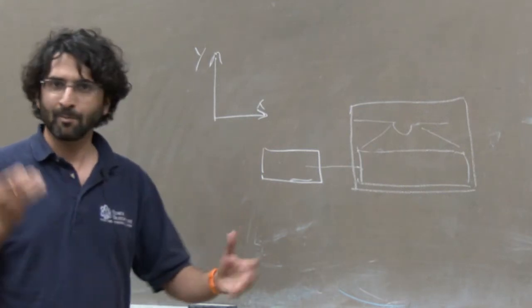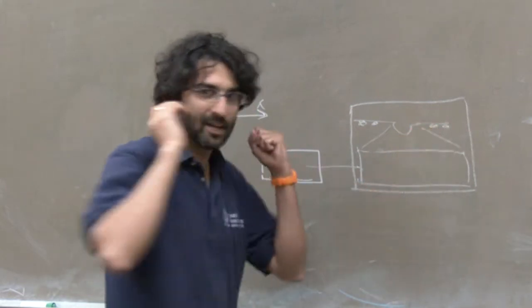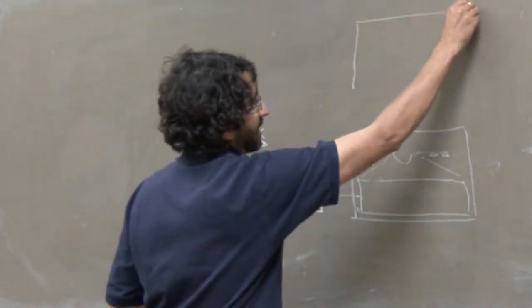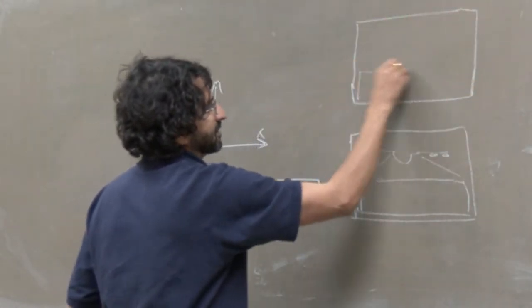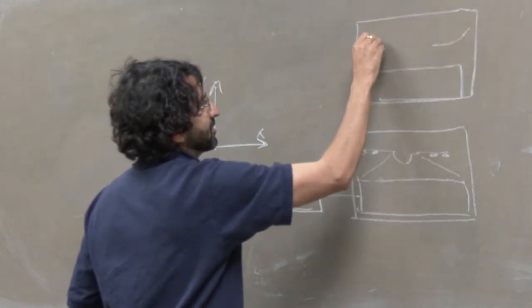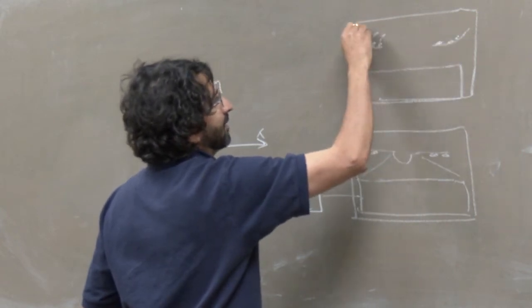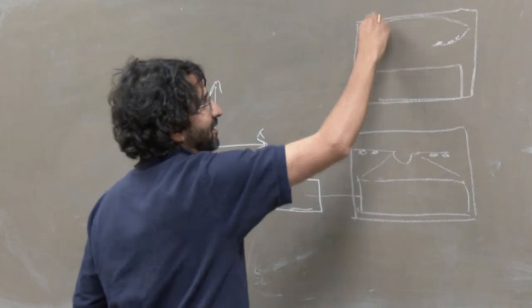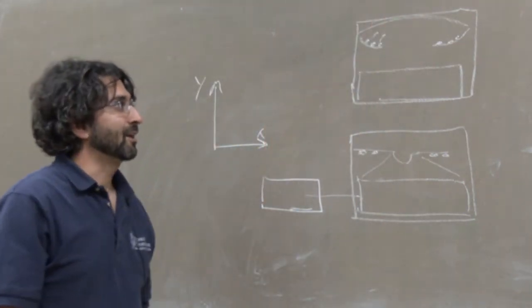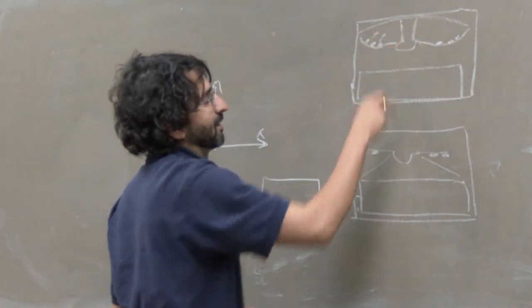Now, in terms of lighting, remember I told you it was a bit tricky because we don't want to put bulbs that shine brightly onto the flies. So the way we did it, let me just redraw that same image up there, with the cassette here, is that we actually enclosed the bulbs on the underside so that they shine upwards, and put a mirror up here that then diffuses the light uniformly onto the flies. So that took quite a bit of trial and error. And also we have the camera there that's then filming the flies.